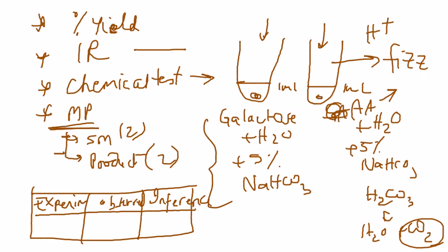Give me the mass of the filter paper, give me the mass of filter paper or watch glass plus the product, and hence the mass of the product, and then the moles. Show me some calculation. Some of you do a great job doing that. Some of you not quite so much. Don't show me anything. Again, each of these is worth points, and the less data that you show, the worse it becomes for you. So please make sure that you take the time to complete your data table. The sample of that is available under Blackboard, so please take the time to go over that. And I'll see you in class.